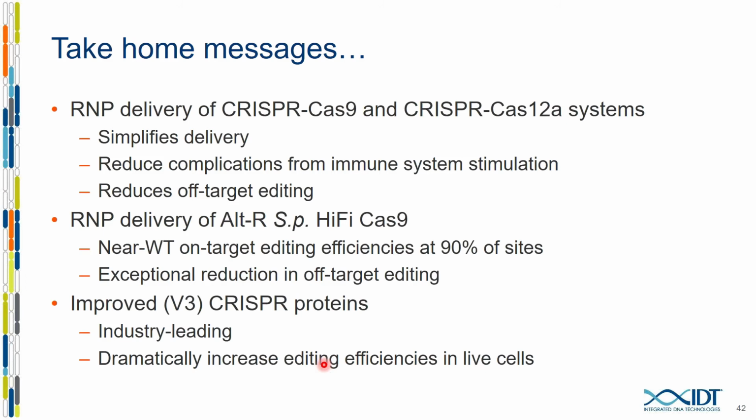Next, Felix would like to know why you focused on using GuideSeq rather than CircleSeq in the presentation. I think that there are many ways to do this, and each has its advantages and disadvantages, and GuideSeq is one of the first to come out, and we latched onto it because it allowed us to analyze global off-target editing in living cells.